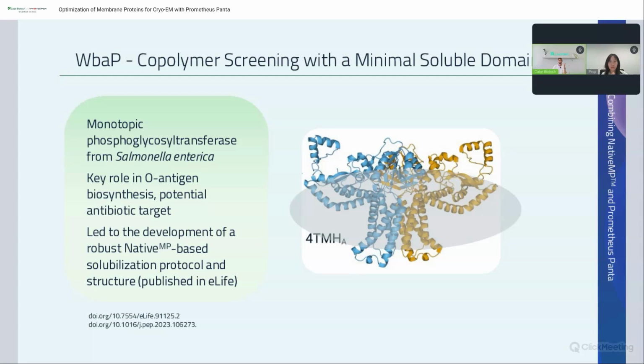Prior to Greg's work, which we can see here, and he actually published the structure of this in eLife, we're going to show you this later. There is no high-resolution, full-length structure which has ever been solved before him. This is largely due to their very challenging nature, and this is really a great accomplishment. Mm-hmm. And maybe for me and our audience, what were the main challenges when it came to actually getting a cryo-EM structure for this protein?